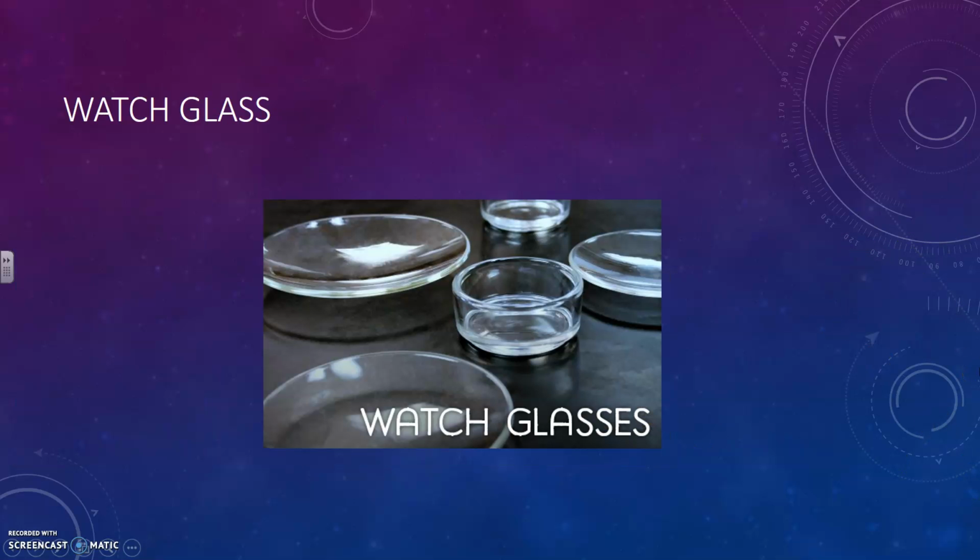You have your watch glasses. I have no idea how these got named, but watch glasses are useful for drying things. So if you have a solid that you have filtered out of a liquid and you need to dry the solid, then generally you will leave it on a watch glass overnight or over a couple days or something.